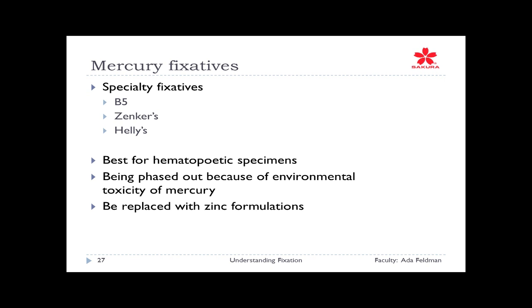Special fixative, and I don't have a slide on this, is for those of you who are doing microwave processing.